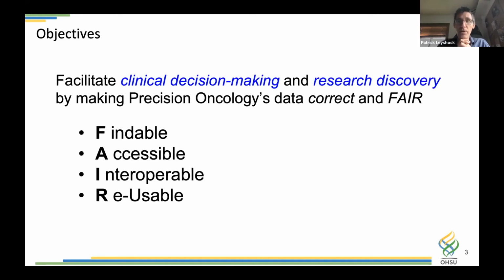A concrete example: some of the groups we support hold both clinical tumor boards, where they consider patient treatments, and what we call data dives, where they actually focus on one individual patient for hours. Researchers and clinicians in the same room discuss different aspects of the patient's treatment history and what should be done about that. So I want to share with you one of the views we've built on top of and integrated with LabKey server to give a patient-centric view of the data.